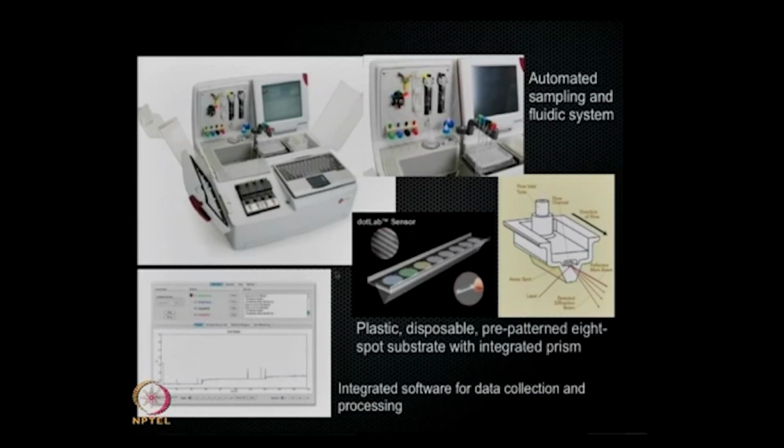And effectively in the instrument, the laser beam runs through back and forth into this. And there's a channel there. There's an insertion port, the injection port where you inject the analytes. And it just goes to that little channel, which is about 20 microliters or less. But it has a pumping system, so you can actually control the flow rate and so on, which becomes important when you're doing kinetic studies.